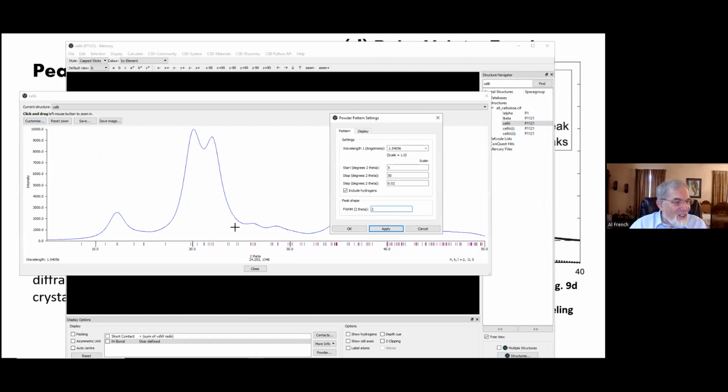And actually there are 3 peaks here that you don't see, and we can see that real well if we make that 0.2. There's a 3rd peak there that's not insignificant, that's lurking in there. But I'll point out that this is the 110 peak, and this is the 020. It's not the 200 peak that you might guess would be there by analogy with Cellulose 1. So this is the 1 minus 10 peak over here, and the 110 peak here, and so forth.